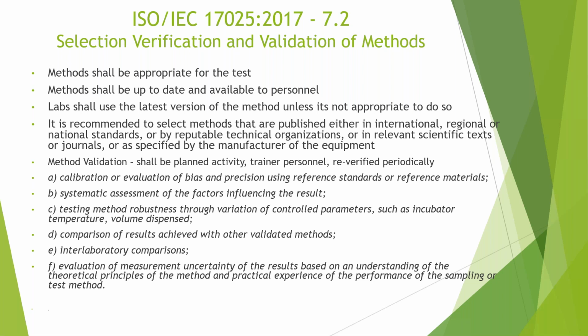Just to recap, 7.2 states that laboratories need to ensure that whatever method they're selecting is appropriate for that test, and that methods shall be up to date and available to personnel. Where available, laboratories should use national or international methods that are reputable and ensure that your personnel has the latest version of those methods.